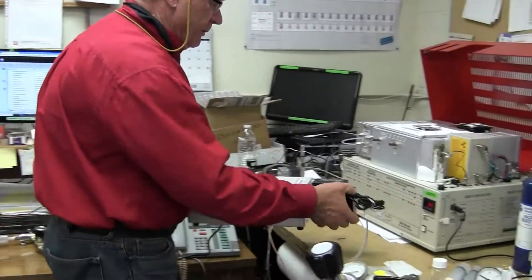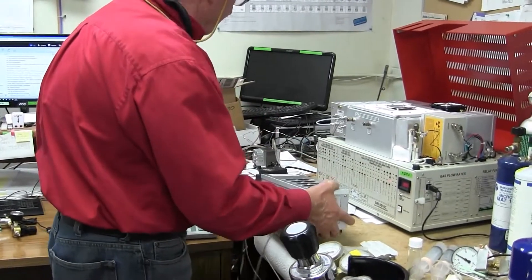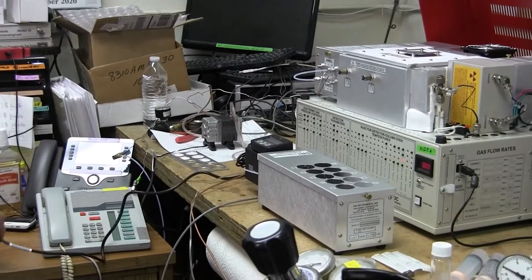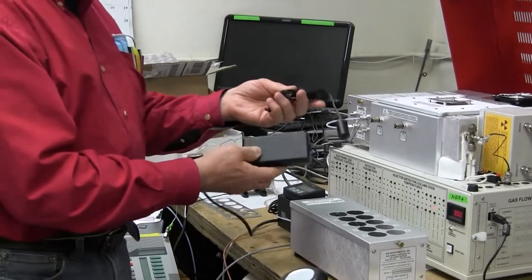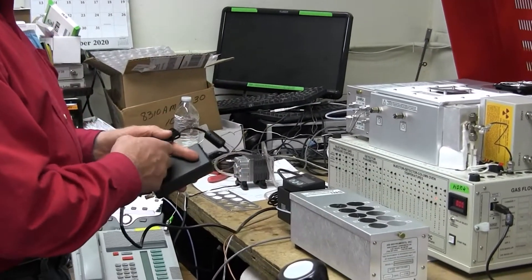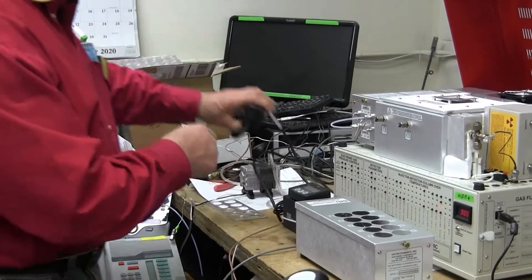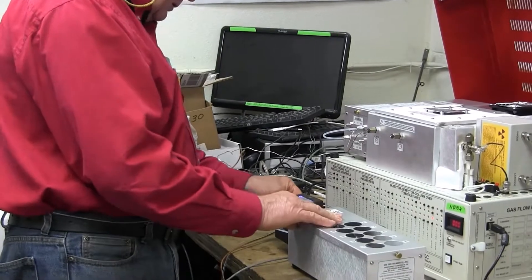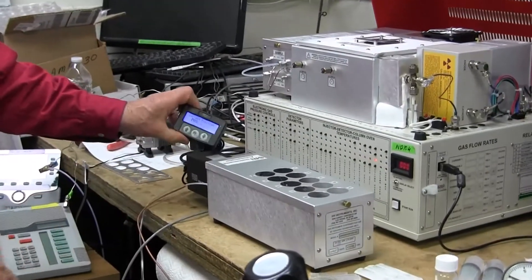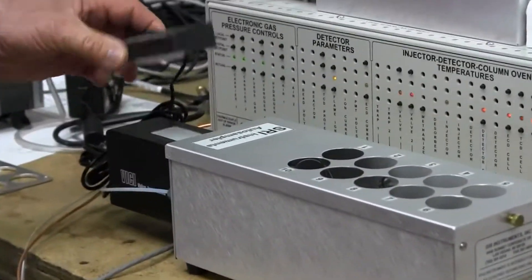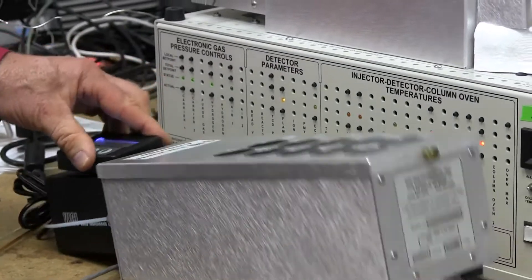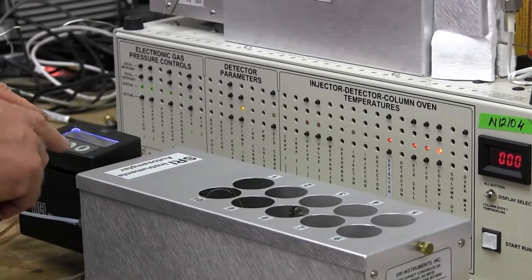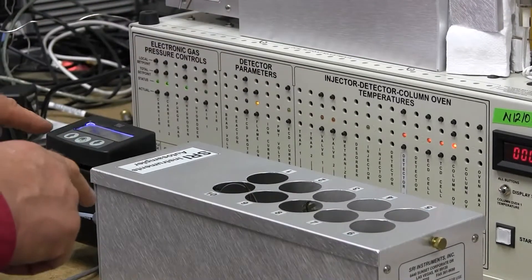So the auto sampler has to be connected to some kind of a power source, which is this common 24-volt desktop power supply, just like for a computer. So that plugs in, and then when it does, the display lights up. So this allows you to control the position of the vials independently of the GC if you want to.